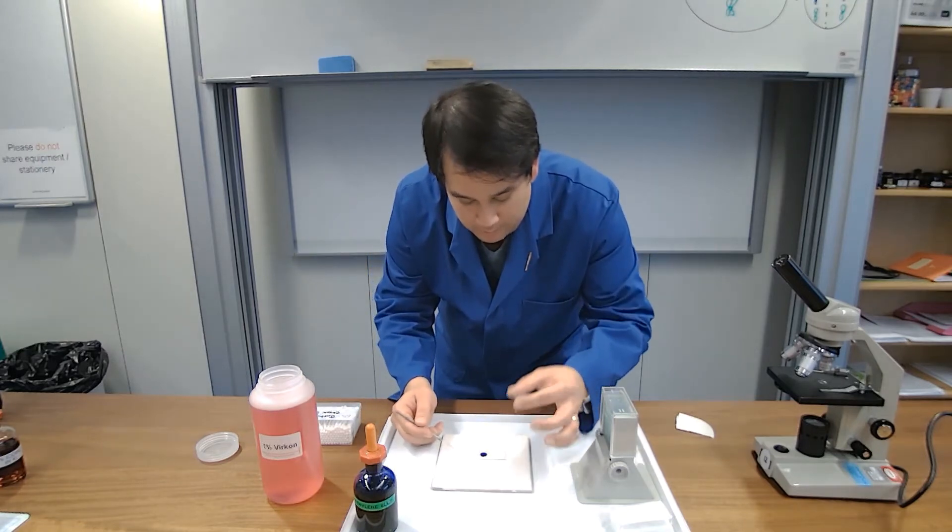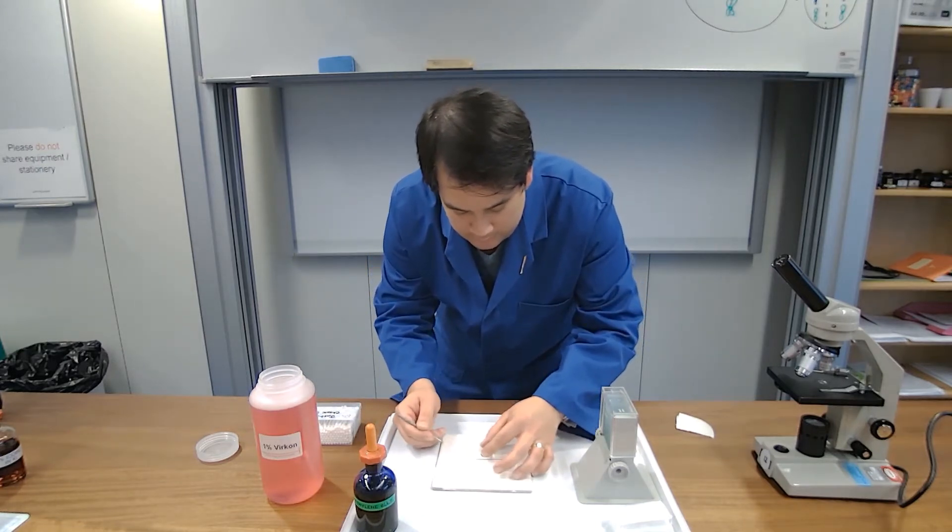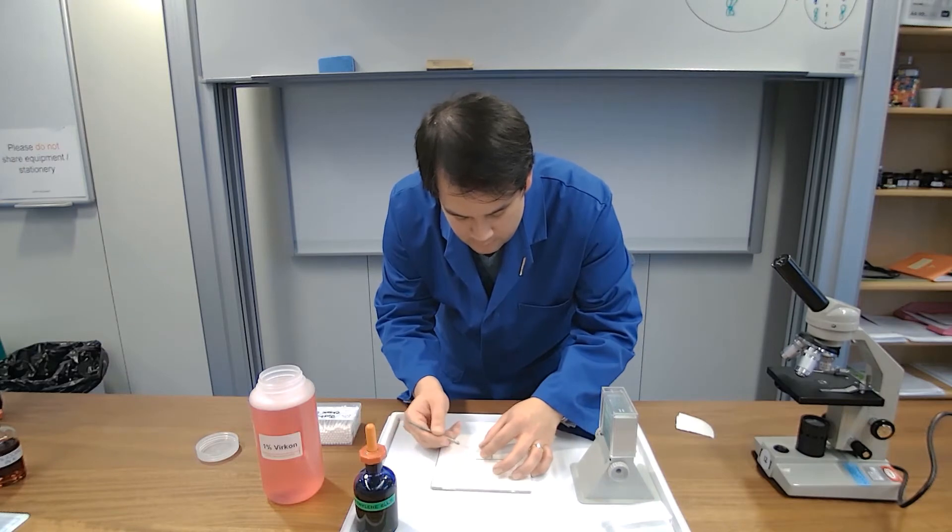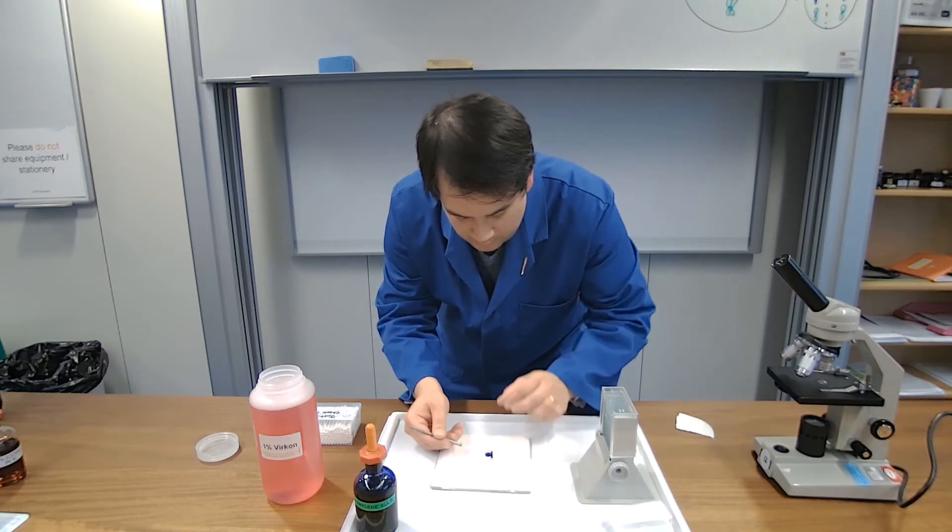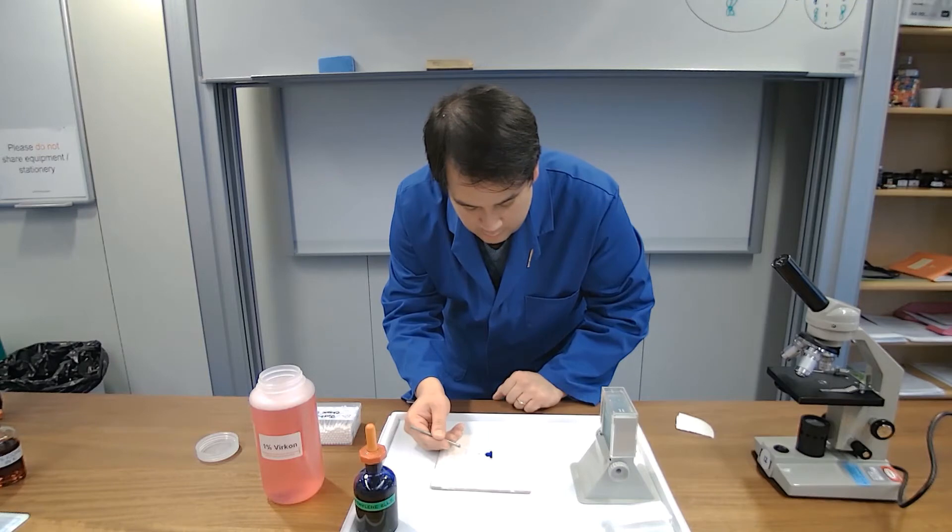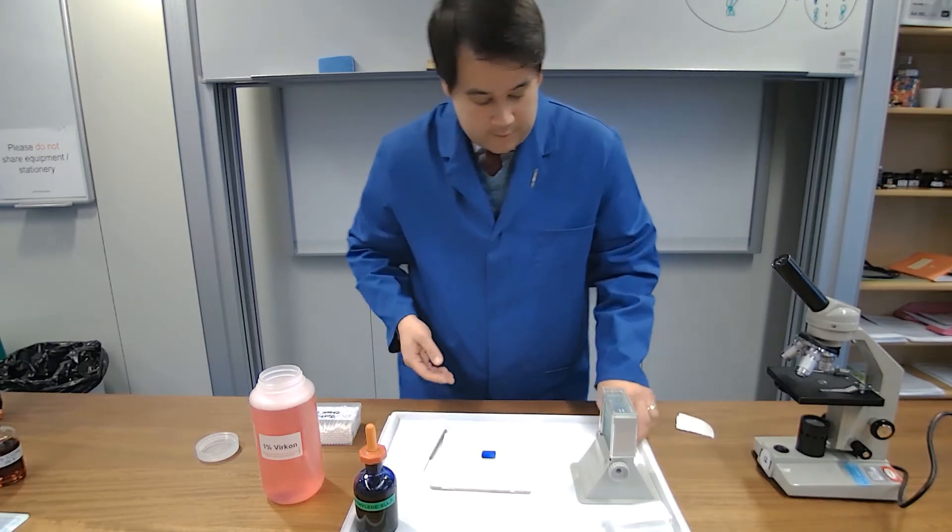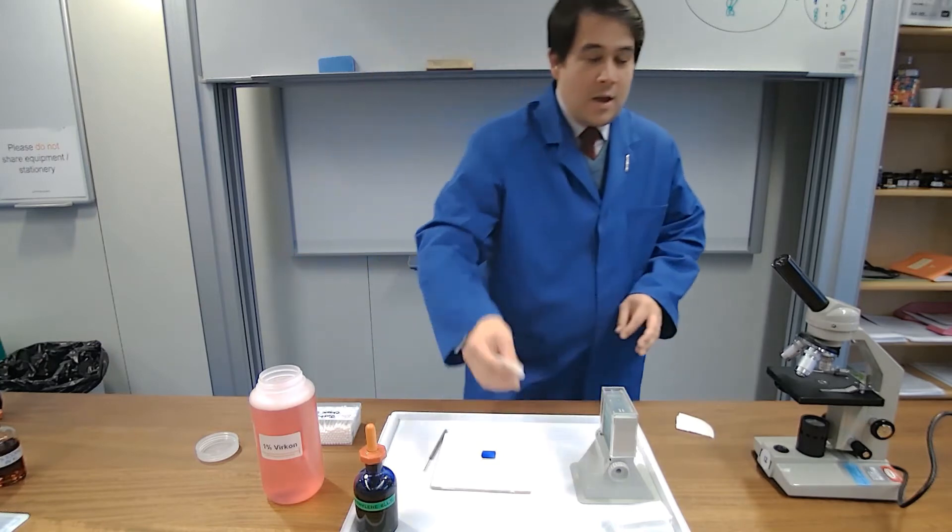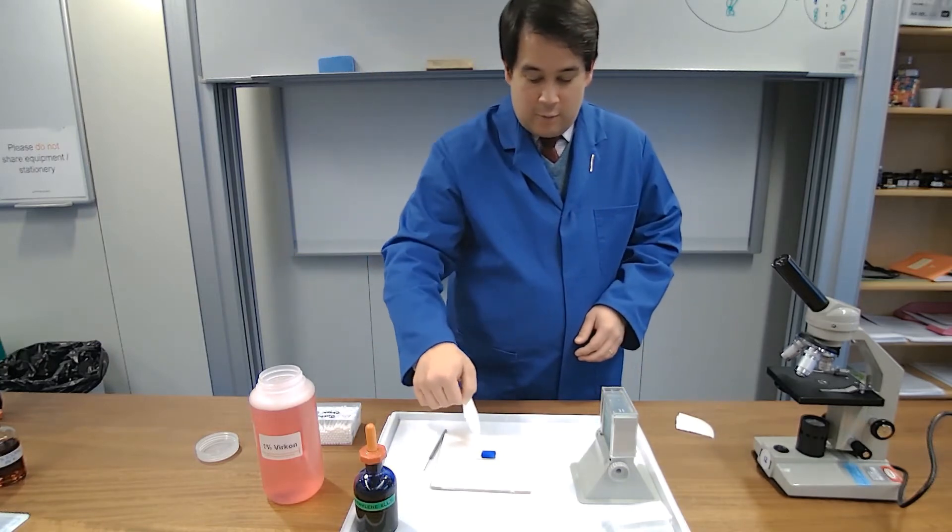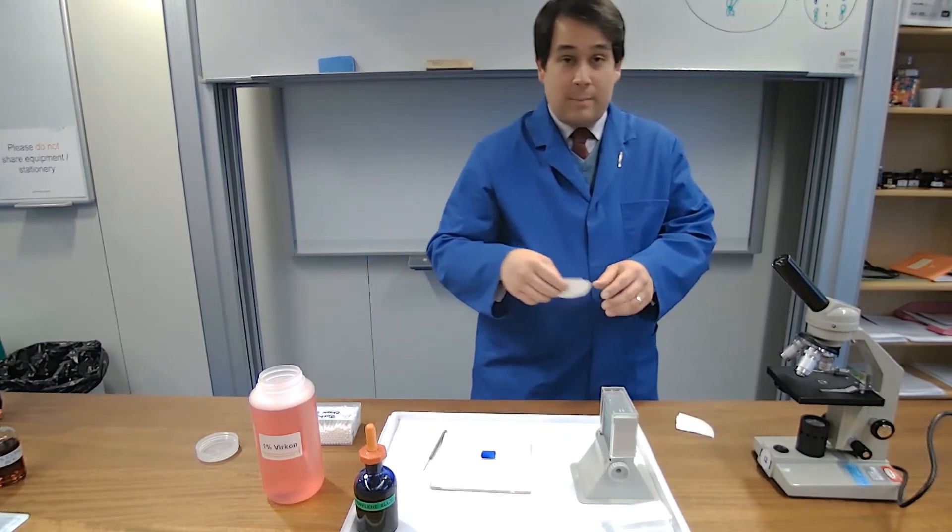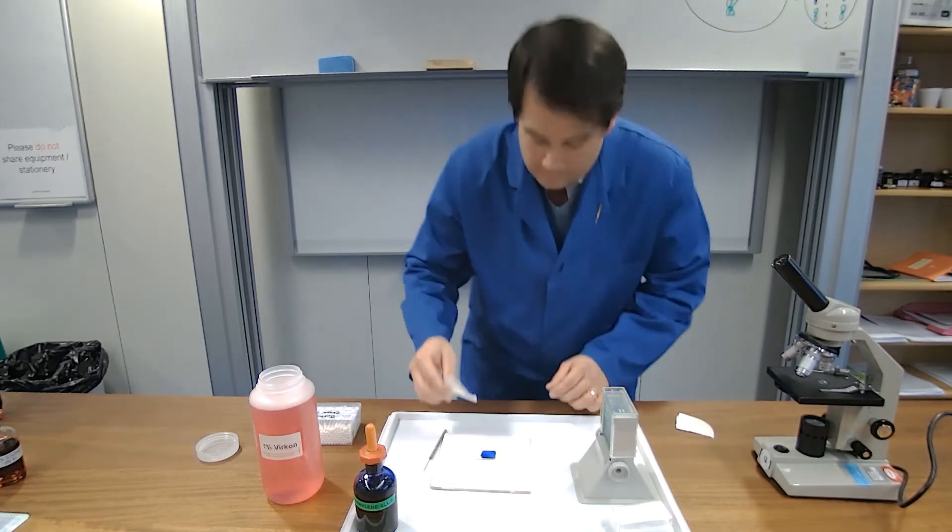So step one, we approach the liquid with the cover slip. Step two, we rest the cover slip on the mounted needle, and we slowly lower the mounted needle and then take it away, and then we have a perfectly made slide, if I just say so myself. Excess fluid, as you can see, gathering around the outside of the cover slip then can be taken away using some absorbent filter paper.